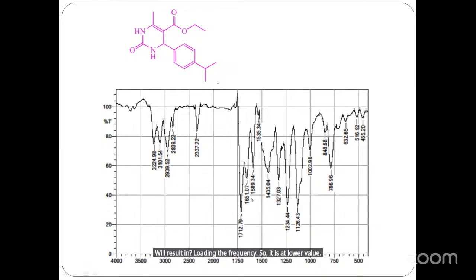Another thing I would like to ask, as you are observing the IR spectrum: the peak intensity of this carbonyl group, this signal, you can see it has more height than this one. Can you tell me on which concept the intensity in IR is determined?